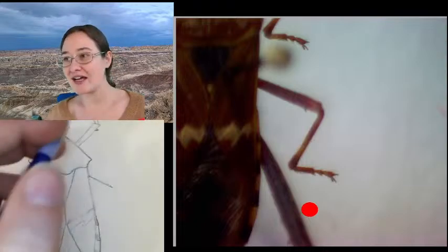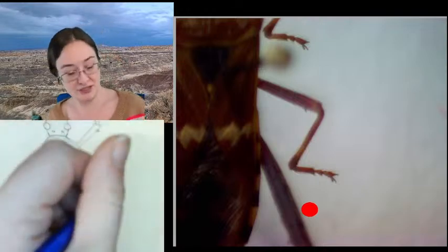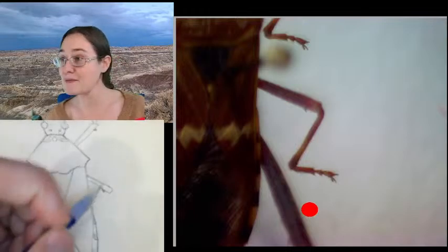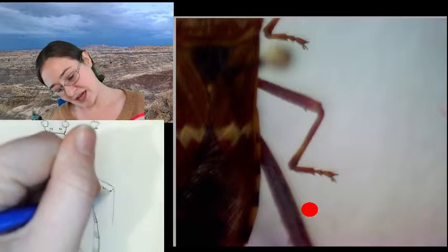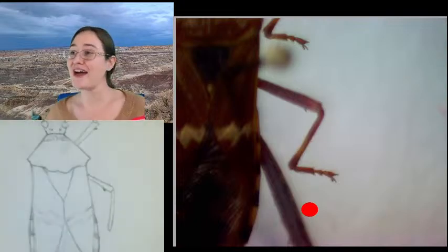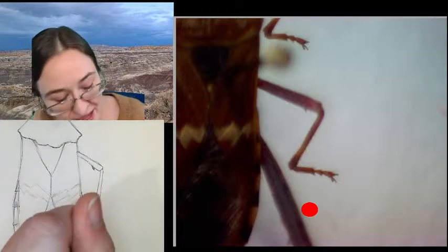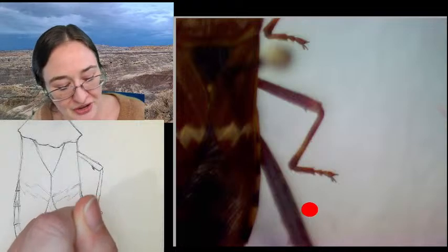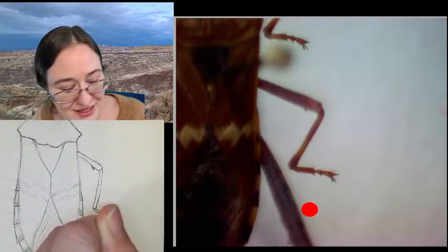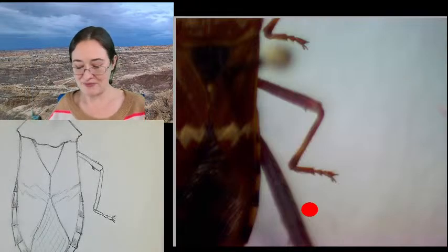Always keeping in mind that a lot of times when insects walk, your front legs are moving forward and the middle and the back legs are moving backwards, giving us this little femoral spine pointing towards its abdomen, and then coming back in, we've got a tibia. It's long and thin. And then we have some tarsal segments, and it looks like the middle leg is pretty much the same as the front leg. So we've got this longer rectangle and two triangles with our claws and our little pads that help us stick to surfaces.